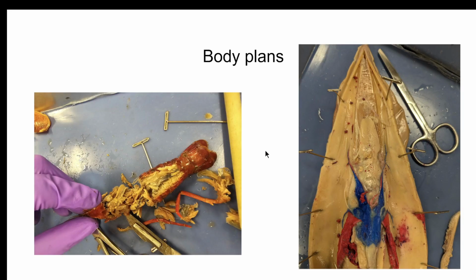When the crayfish was cut open, it led to all these organs, such as the circulatory system, muscles, the digestive system, and many other bodily structures. This means that the crayfish is a coelomate, because it has this body cavity called a coelom, but it is also completely lined with mesoderm. The mesoderm allowed it to form many of these organs that I was just talking about, such as its muscles and circulatory system. The squid has a coelom as well.